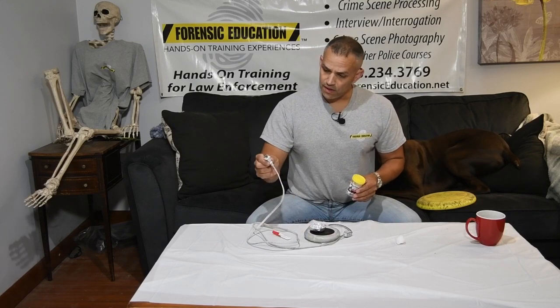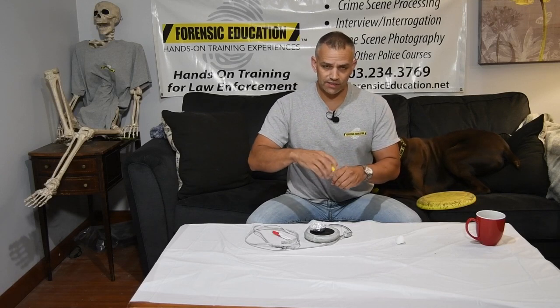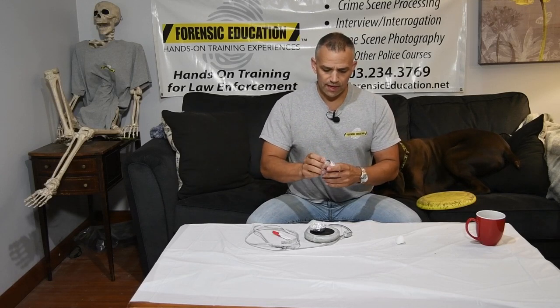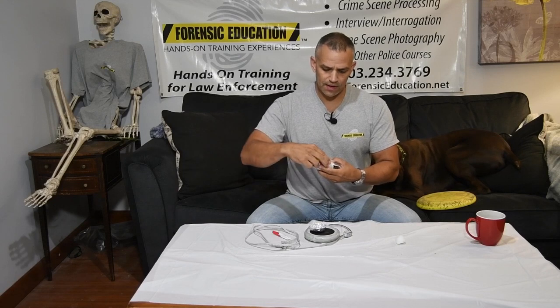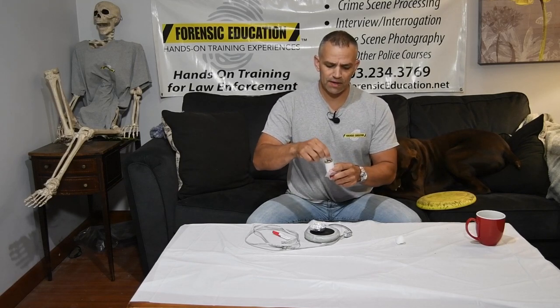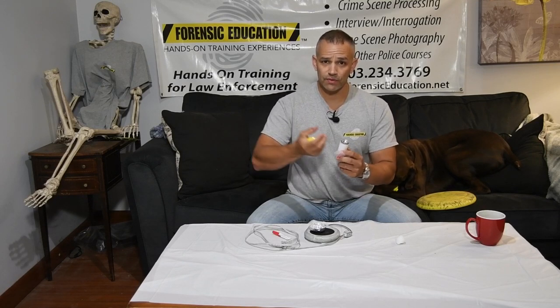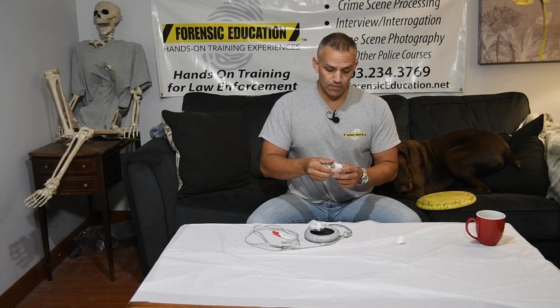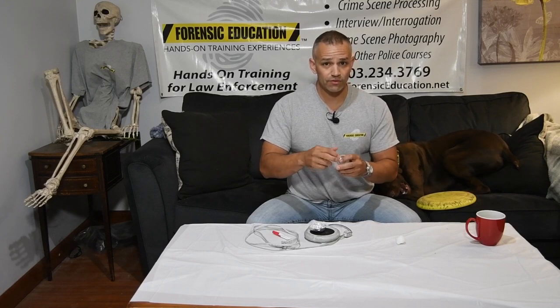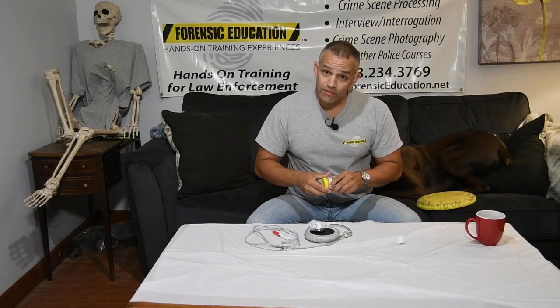If you don't have power, you can also use a hot shot. The hot shot is a self-contained unit — it has an activator packet, a canister with metal on the top, and your superglue goes on top. That heats up and fumes for several minutes. It fumes amazingly, but sometimes you don't have those either.